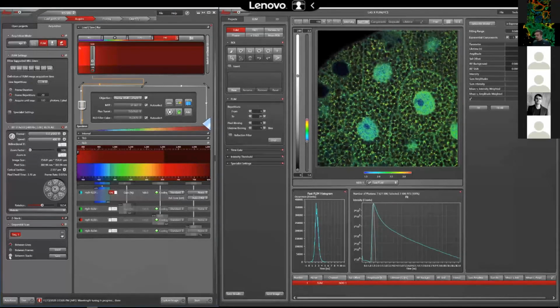Yes, Connie, Hela is also mentioning there is a feedback loop in your voice. But also Mariano is mentioning that the point here is that you need to have the time between two pulses, as I mentioned earlier, long enough. So Connie is saying, Fabian, you almost mentioned that it's 10 times longer, but I think it's something like 5 times longer. It's quite enough to see the complete decay. And Mariano as well is responding to that.